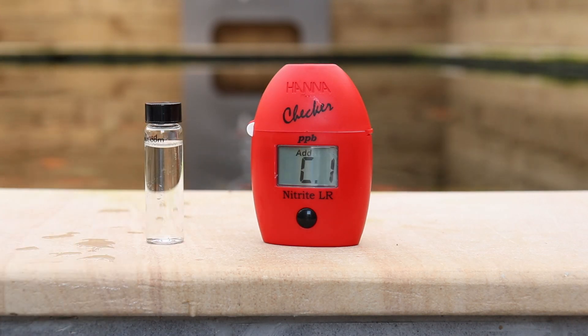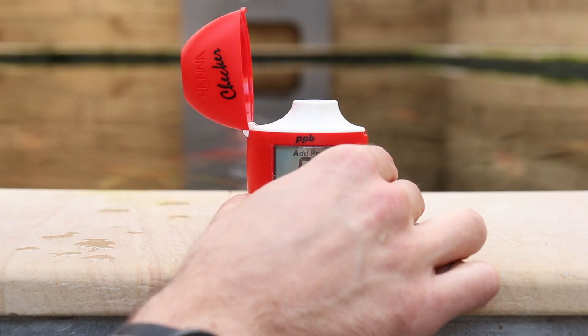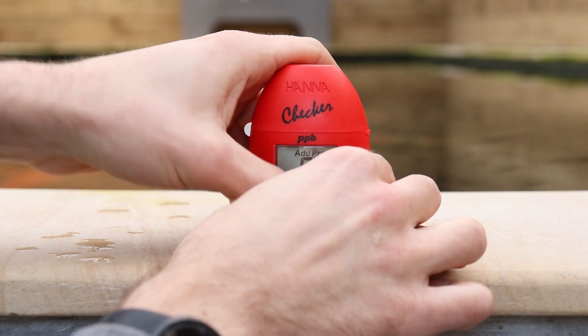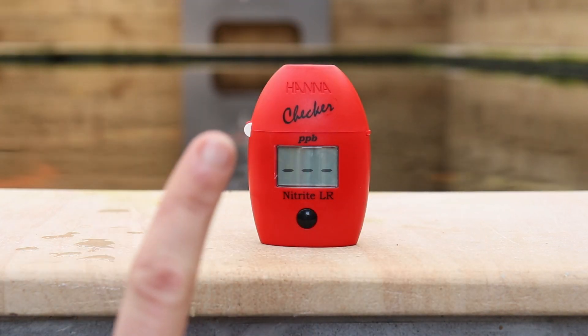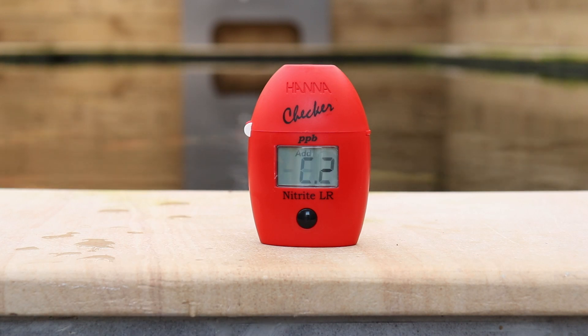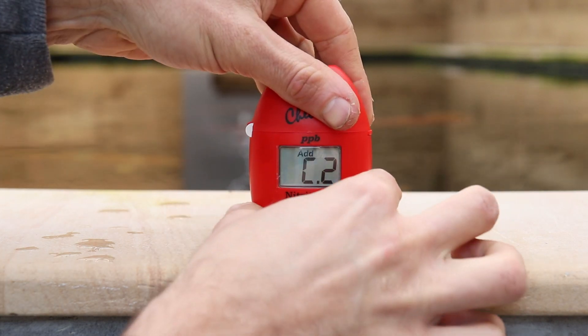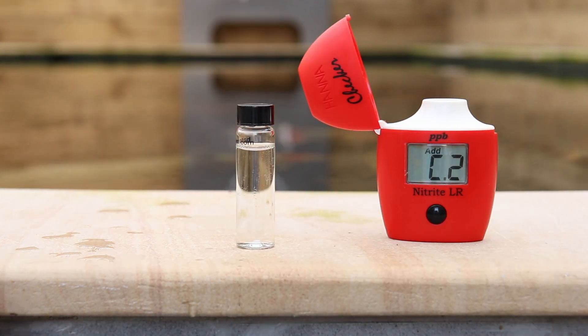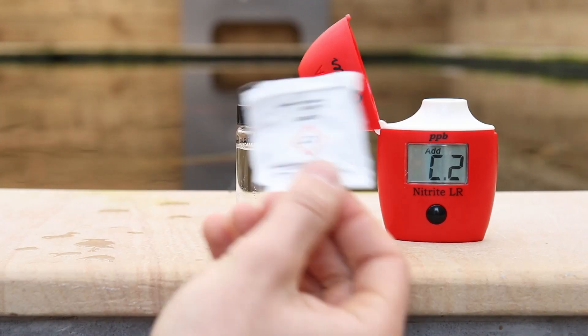Now we need to calibrate the meter before we add any reagent solution. To do this, open the top of the pocket checker, place the cuvette inside and press the button on the front just once. This will flash for a few moments. All it does is take a light reading from inside the pocket checker, so after you add the reagent it's going to measure the difference in the colour of the water. Once it's displaying C.2, calibration has taken place. You can take the cuvette back out of the meter and we'll get one of our reagents.